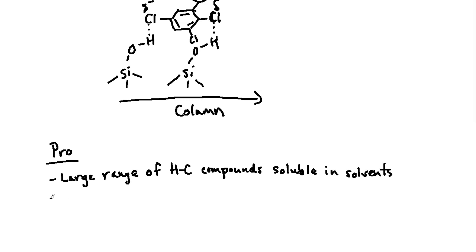Now, one that may be overlooked sometimes is that because we're using these nonpolar solvents, the solvents that tend to be used here are going to have a lower viscosity. Now, viscosity is a chemical term that is used to describe the flow, how thick a liquid is. So we would say something is very viscous if it pours slow, for instance, maple syrup. Whereas something is not as viscous if it pours very readily or rapidly, like water.